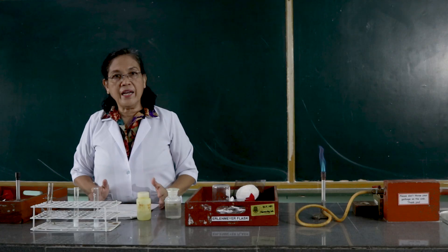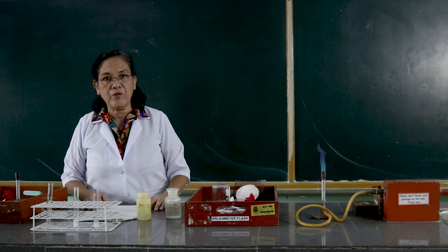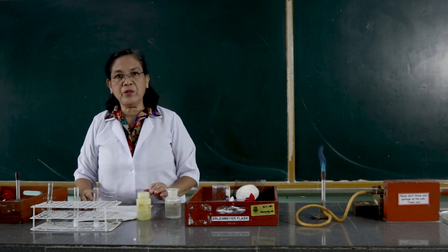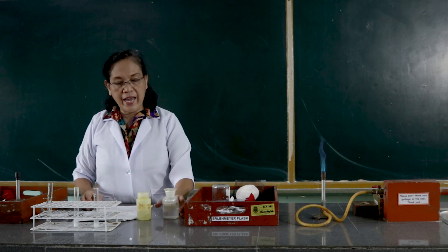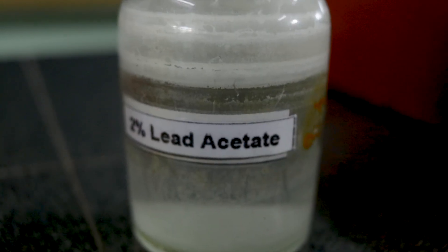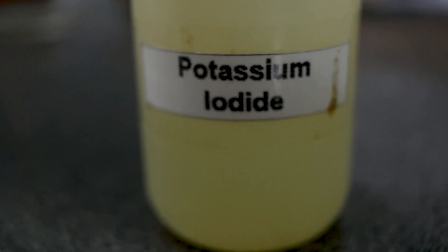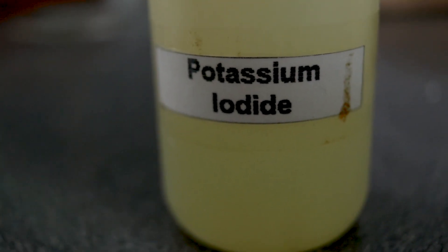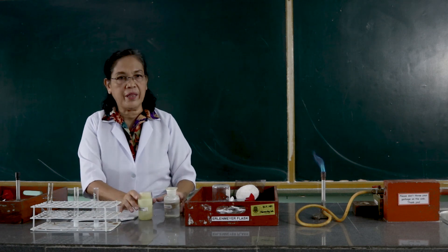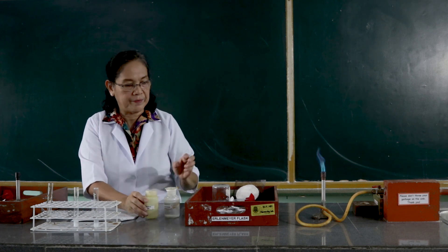Another double decomposition reaction that we are going to perform is the reaction between lead acetate and potassium iodide. We will get 3 ml of the lead acetate and add it with 3 ml of the potassium iodide.